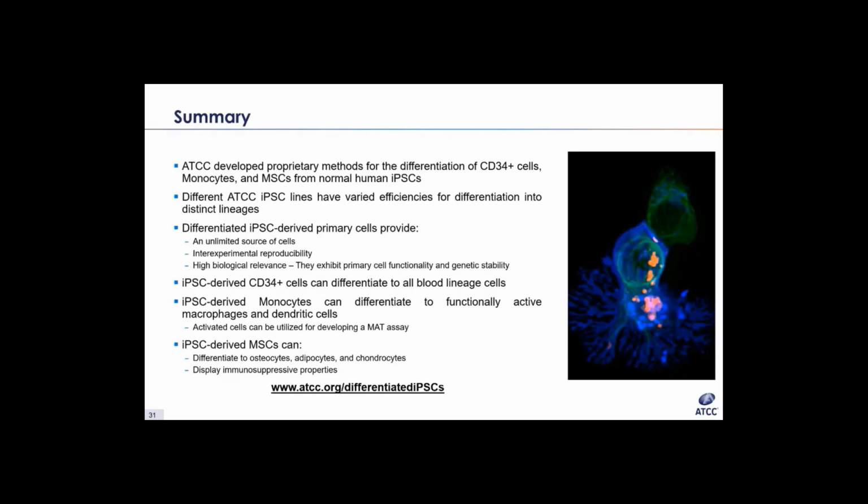And this is actually a pretty good question. Does ATCC warranty include differentiation efficiency of the iPSC?